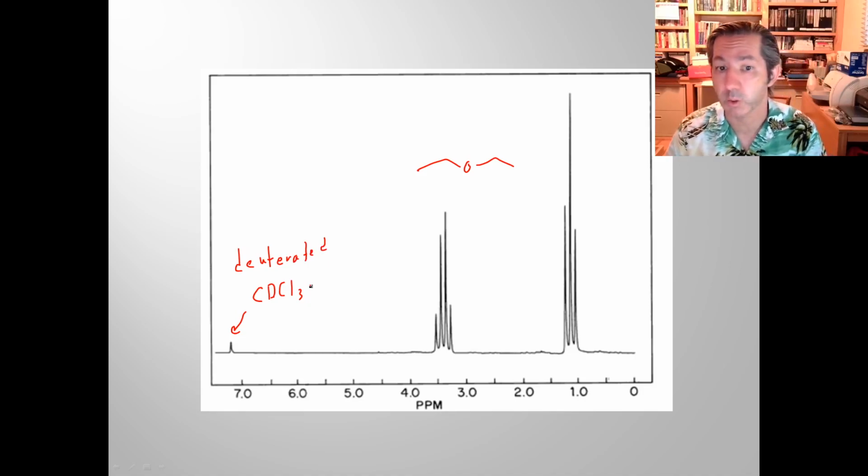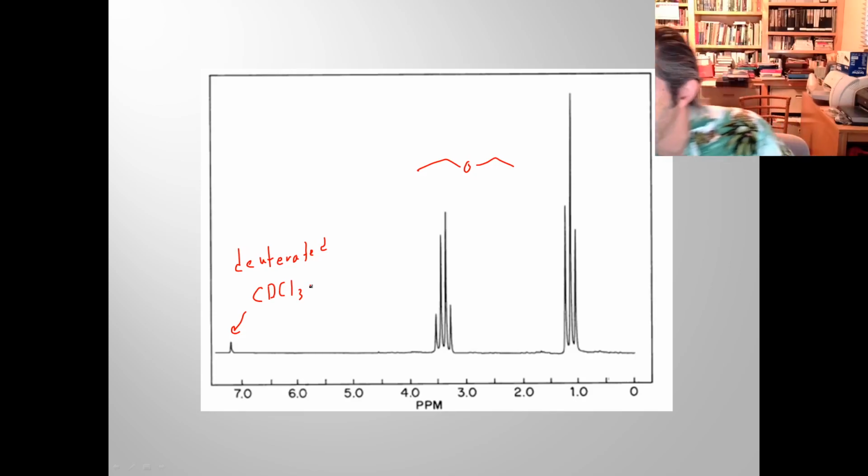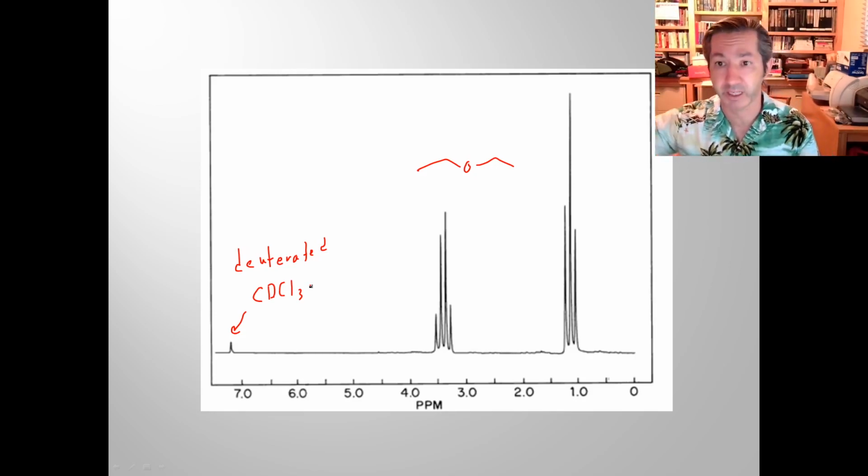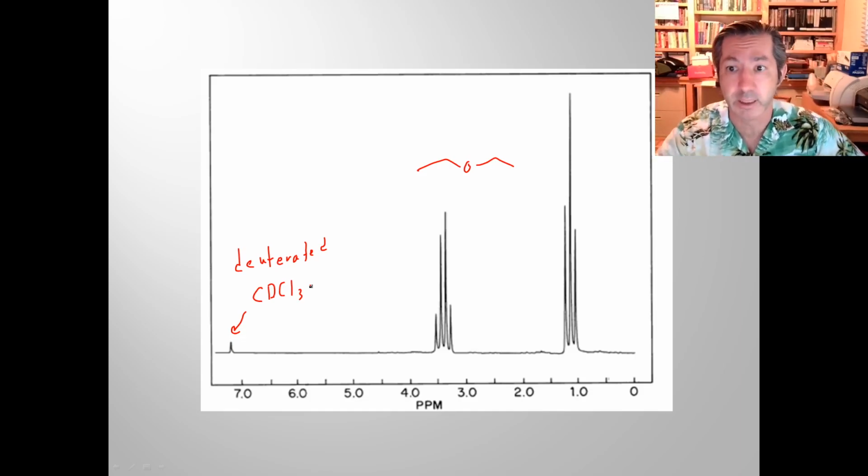So we use deuterated chloroform. That's not usually what a criminal will soak a handkerchief with to kidnap a victim, because it's way more expensive than regular chloroform. Got to be economical about these things.